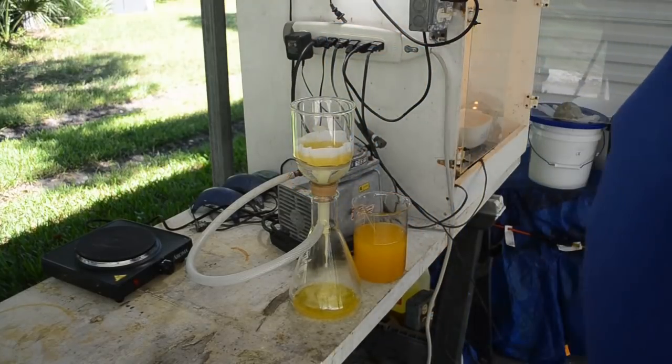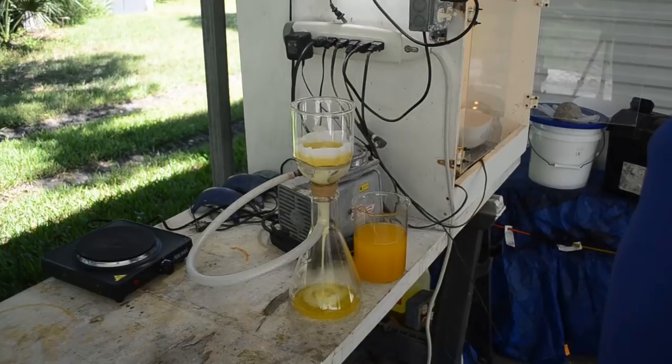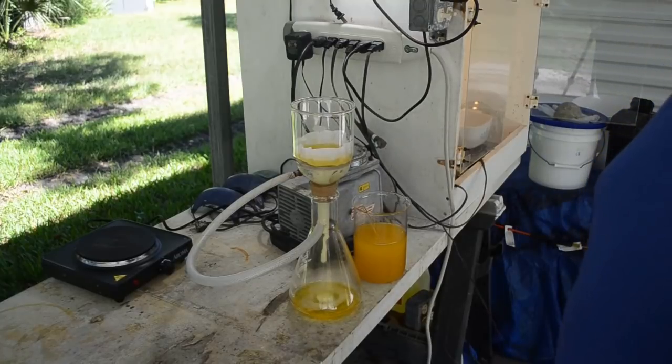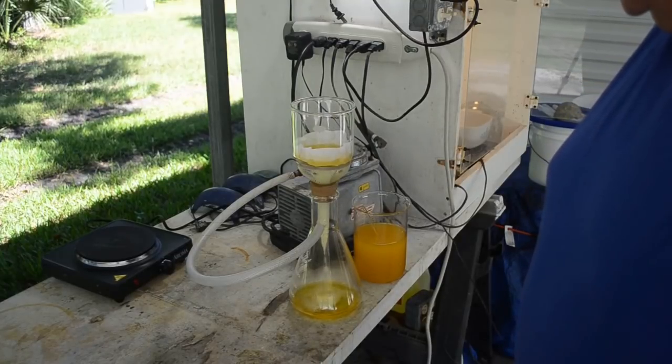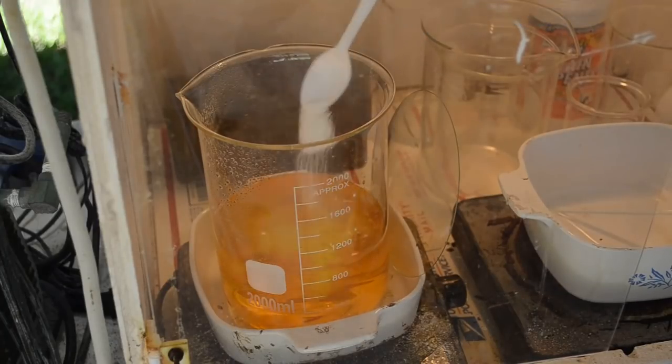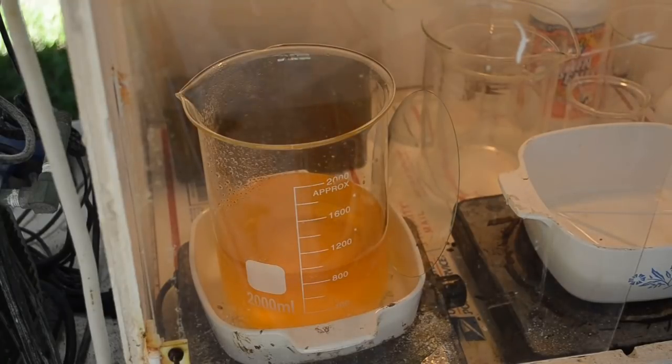So I'll filter it all through here and put it in a clean beaker, and we'll drop the gold one more time and see what we get this time. Right, filtered, back in a beaker. That is a gorgeous colored liquid right there. I think we're gonna have a much better gold drop this time, get some good clean gold out of it, be able to weigh it up, and finally put this video to bed.